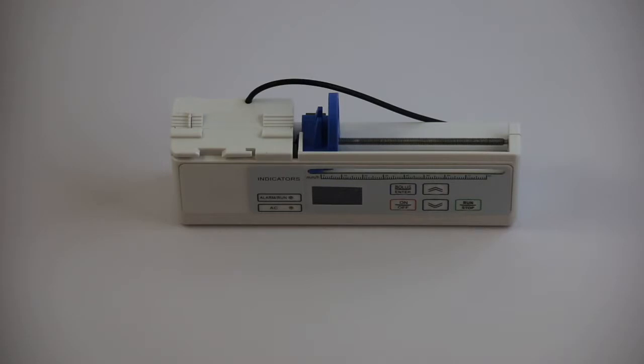It is important to set the correct parameters according to the syringes that will be used with the pump, as this will determine the accuracy of the volumes administered by the pump. Syringe parameters can be set for up to 10 syringes which can all be modified at any time.